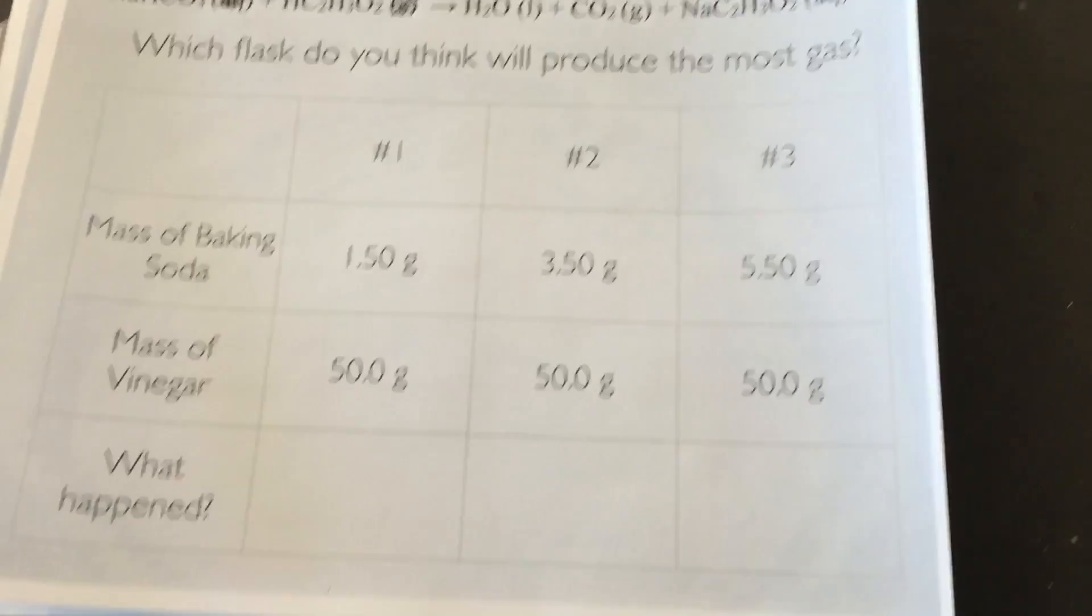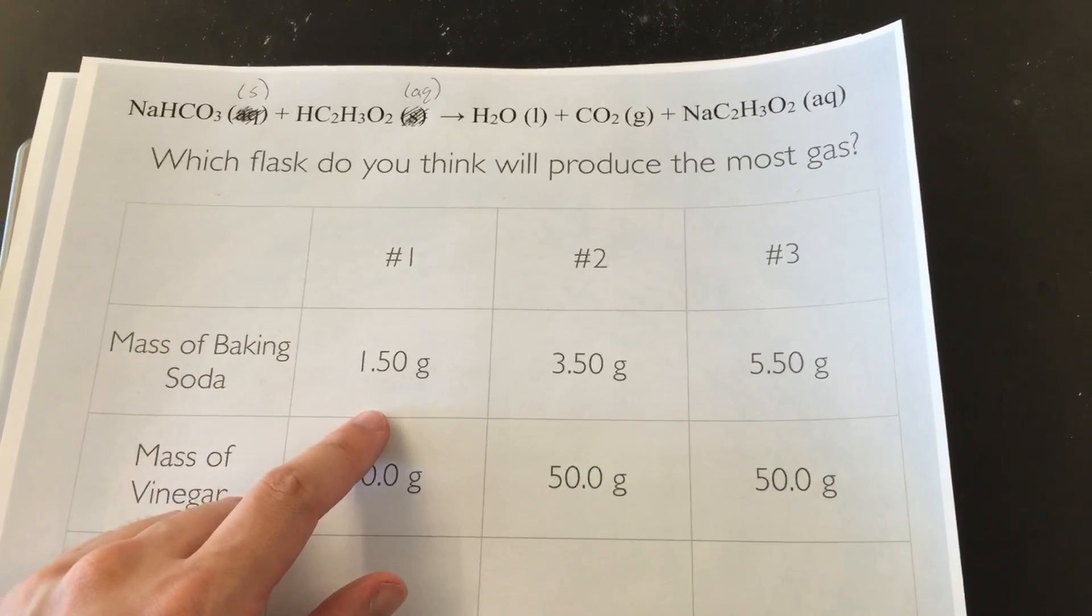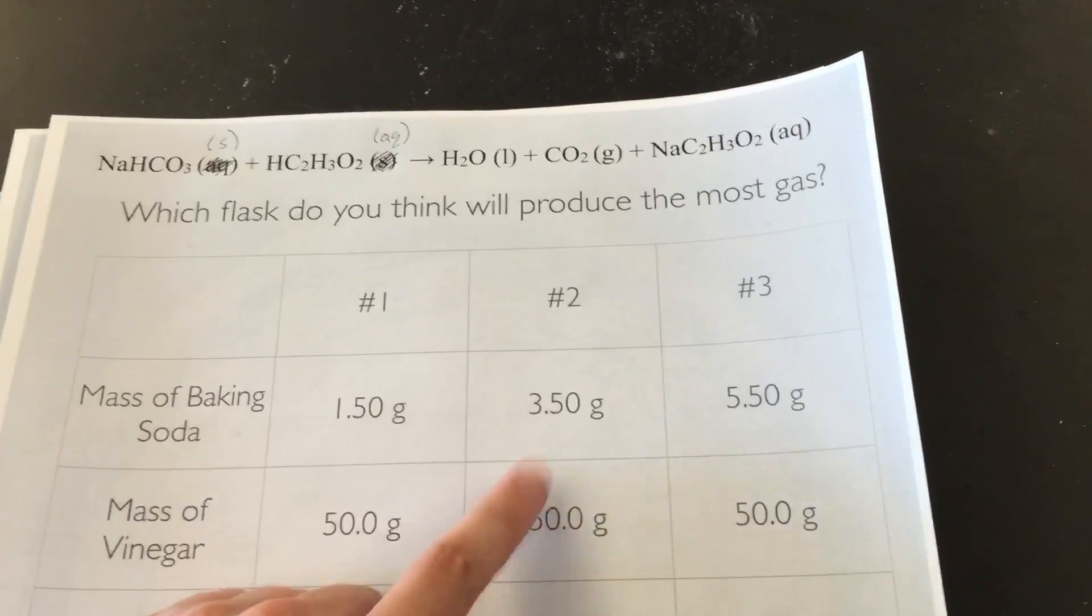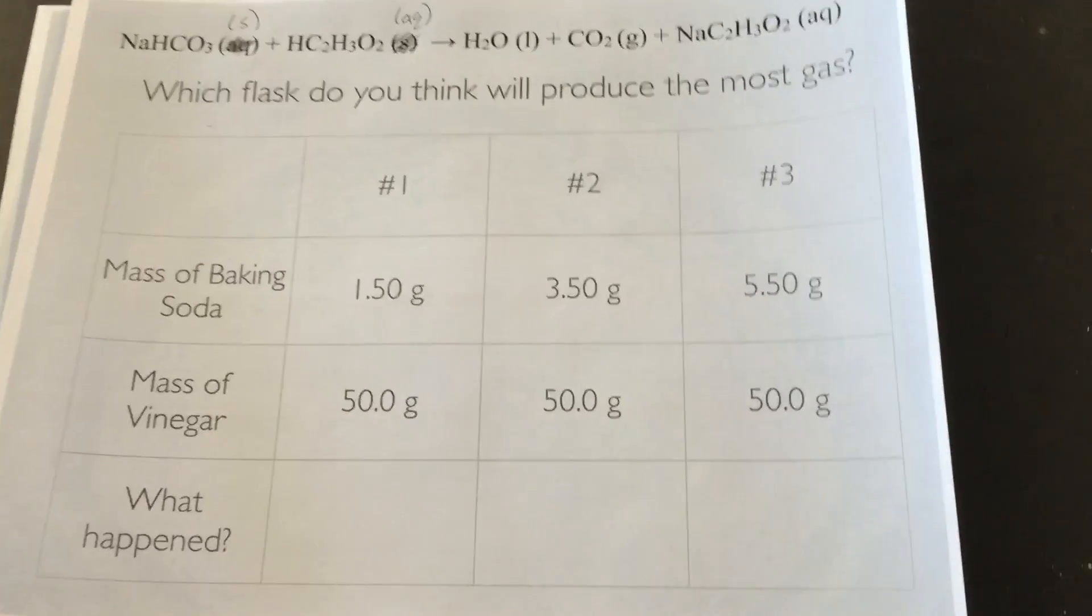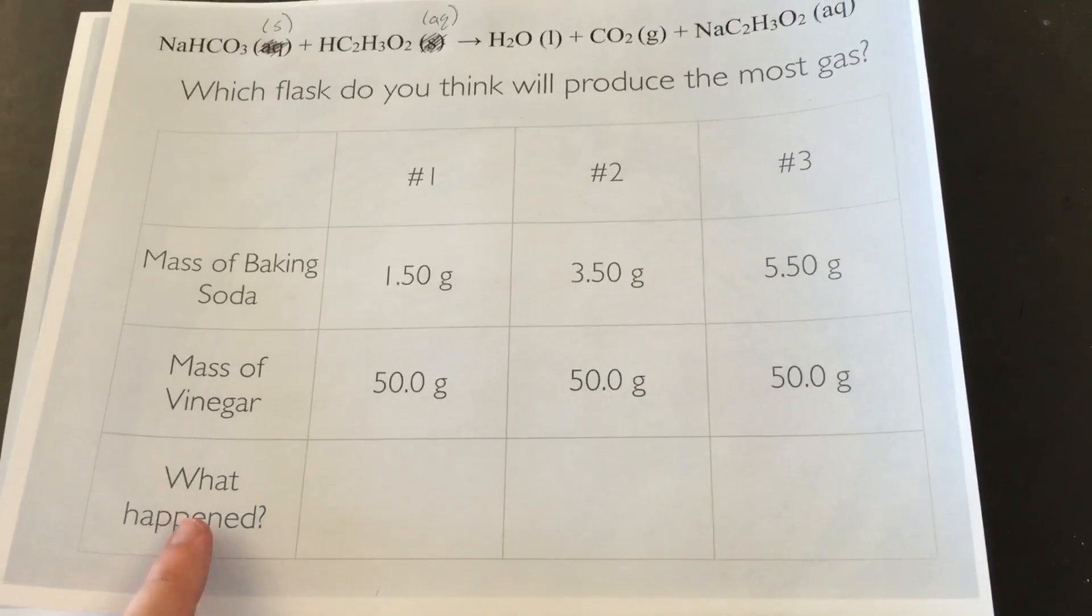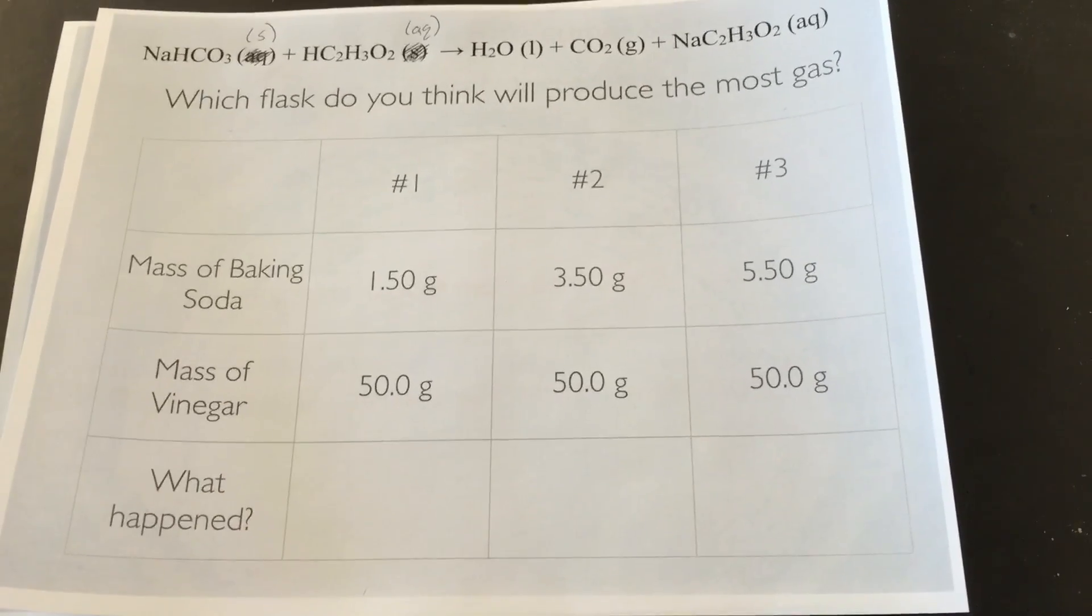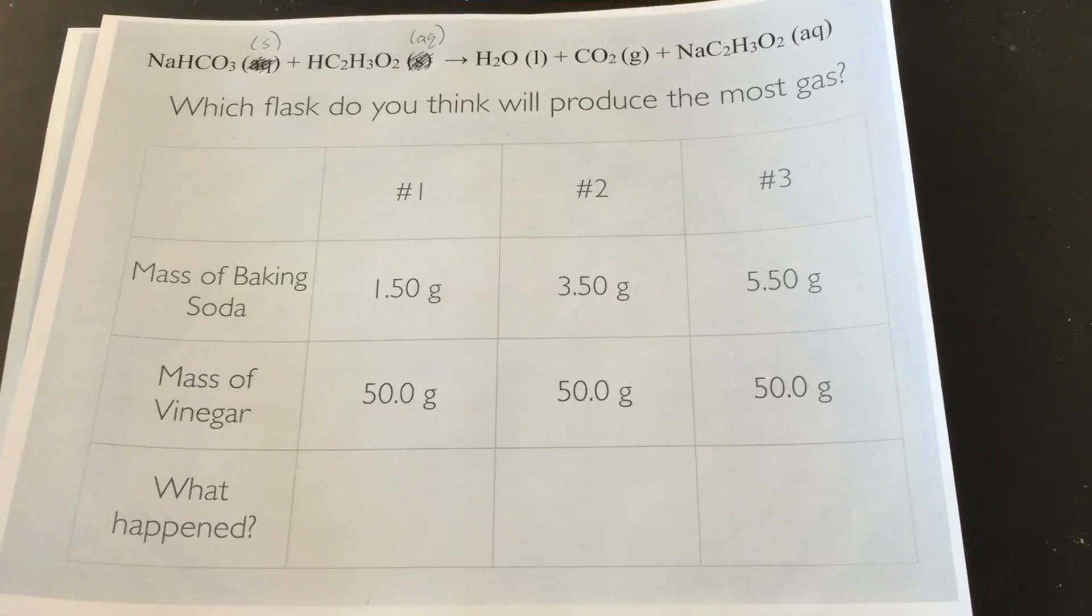The variable that we're going to be changing here is the mass of baking soda. So I have 1.5 grams in the first container, 3.5 in the second and then 5.5 in the third. So construct a table that looks like this and then this is where you're going to be recording your observations. You can pause the video if you need to construct this table but we're going to be looking at our reaction now.